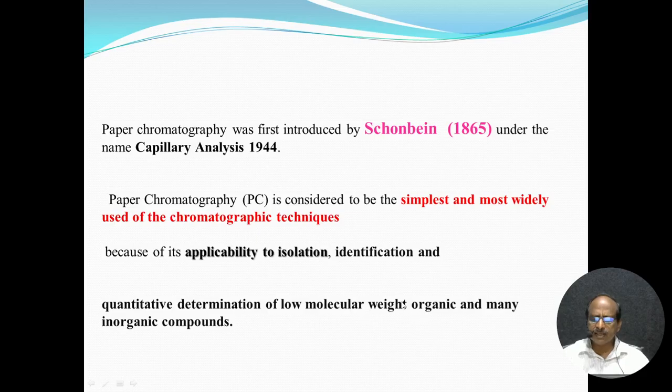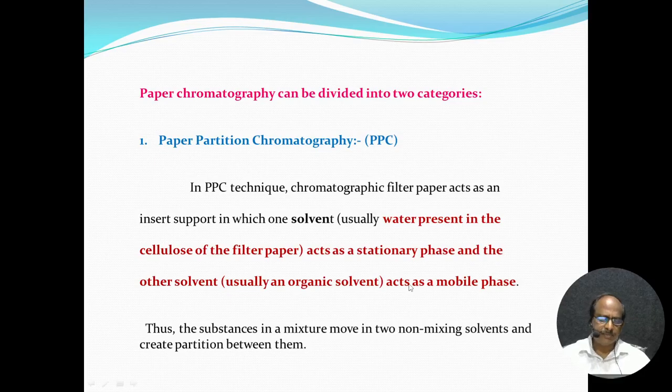Not only for organic compounds, but also for inorganic elements, such as trace elements present in any sample, we can do quantitative determination at very low molecular weights. That is paper chromatography globally.